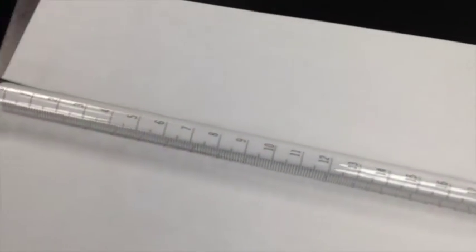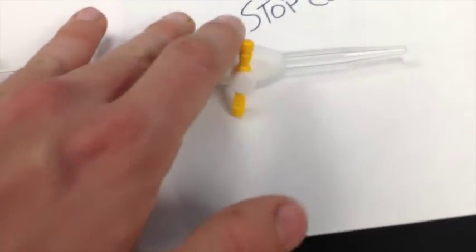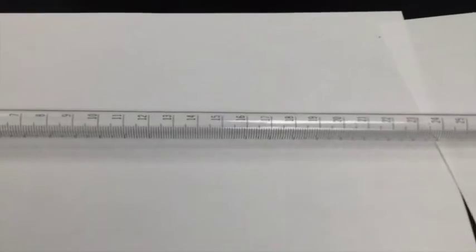You'll note the numbers end at about 50 and start at the top at 0. That makes sense because we don't know the volume from the line down, or the volume inside the valve body or in its nozzle. But we do know where we start, and as the water drains, we'll know where we end.